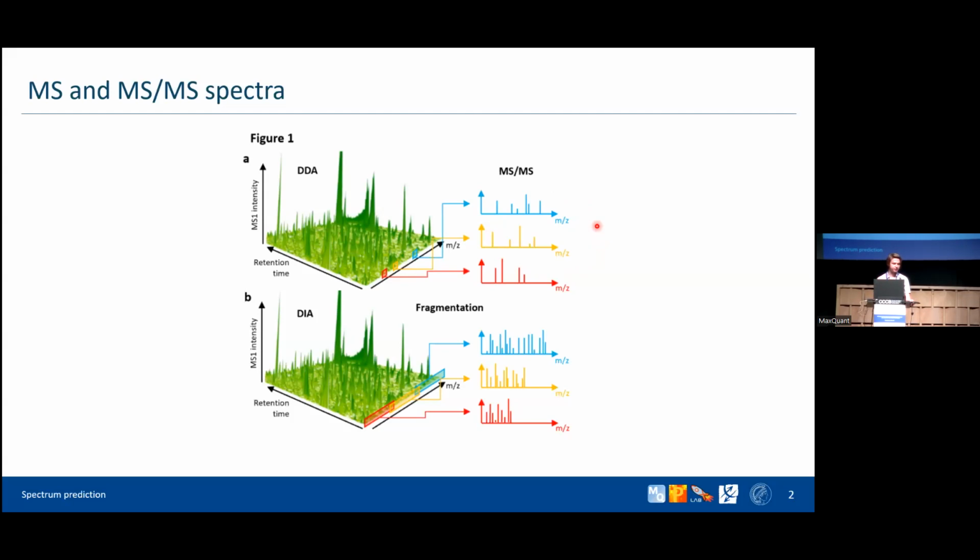It can be done using several methods. One of them is called database search. And it relies on our knowledge of peptides because they have oligomeric structure. And we know that bond breakage occurs primarily in the backbone. So we can exploit fragmentation spectra to identify the precursor sequence. And moreover, if we know the fragmentation method, then the fragment masses can be easily calculated from the peptide sequence.